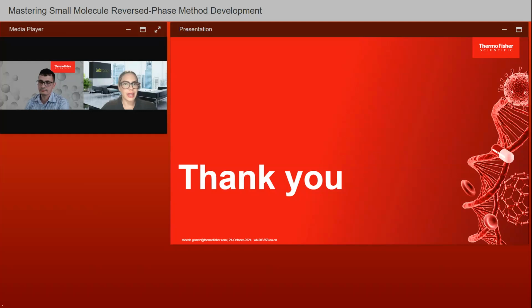All right, great. Thank you. Looks like we have a few more here. This next one says, how do you select the right HPLC column for a new sample?